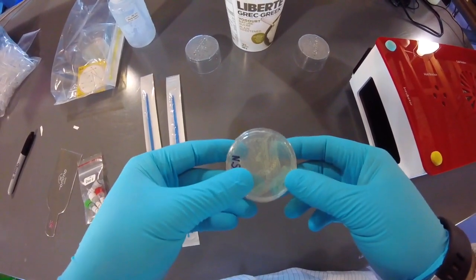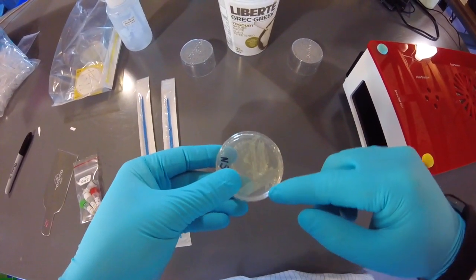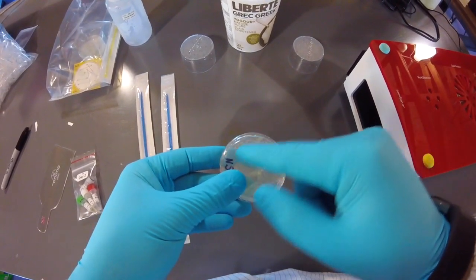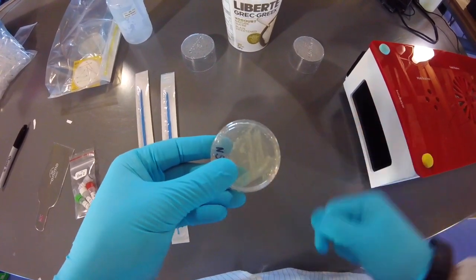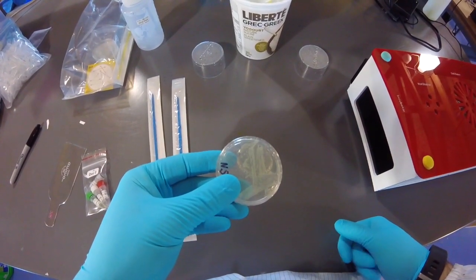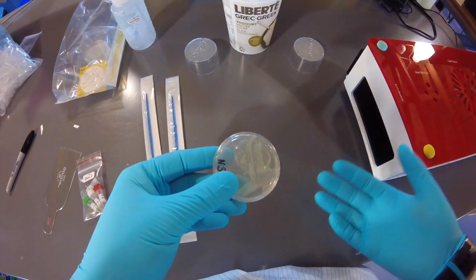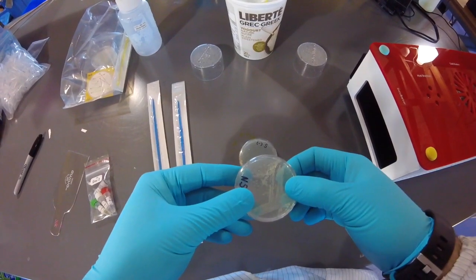You'll remember that the first line had lots of cells on it. The second line you can see it dragged through, dragging less cells. And then the third line, especially the one that went across here, we're getting individual colonies. And that's exactly what we want. We want these individual colonies of cells that are growing quickly, and those are going to take up DNA the best, okay? And just to remind you about the time schedule, you definitely want to do this step before 24 hours later.